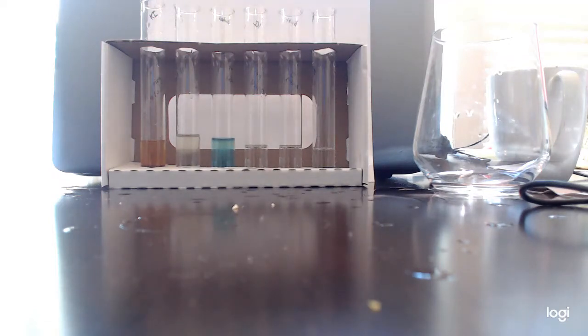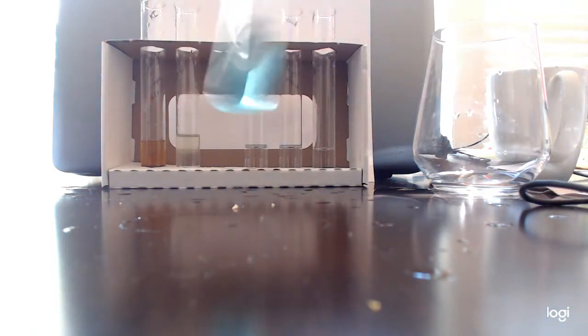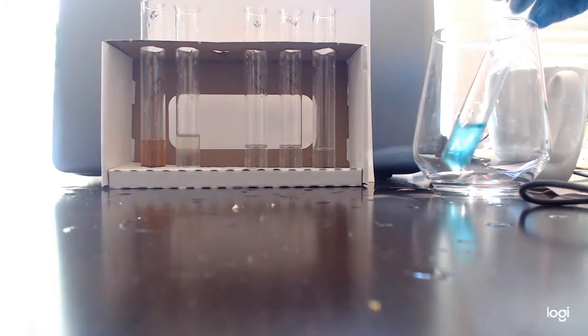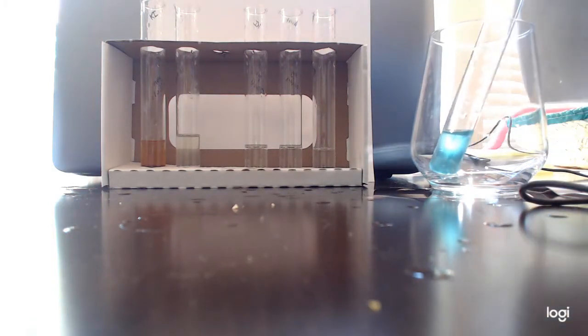That tests for sugars. Now, just because the orange juice is orange, and because this test is positive when it's orange, I'm going to go ahead and show you that right now it's actually still quite a nice blue. I'm going to put it here in our hot water bath. I'm going to grab the hot water that I microwaved off camera. Oh! I put it on the side. And I'll go ahead and pour it into our hot water bath.